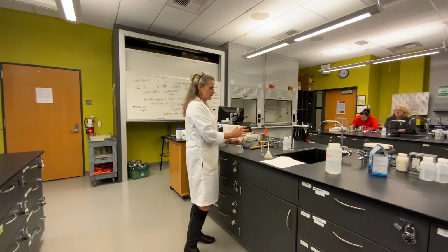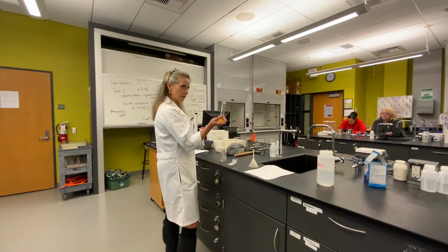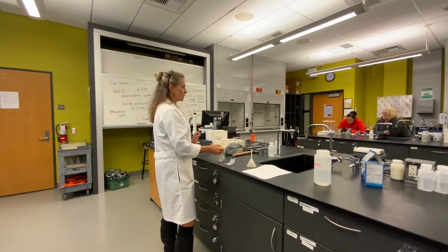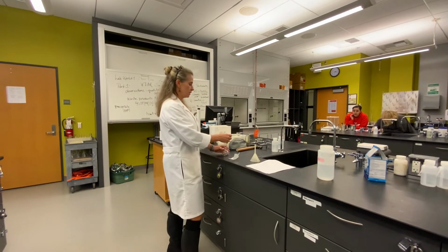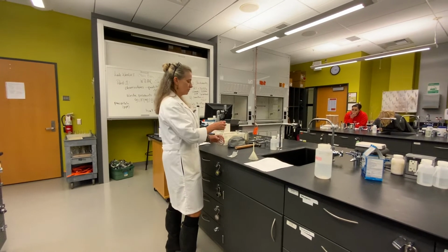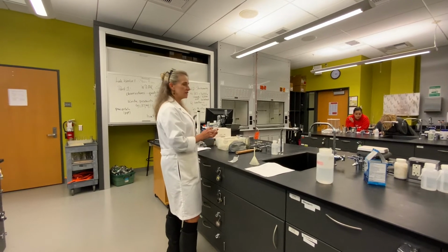So do the best you can to get all of that in there, all right? And then when you pour the 25 mils of hydrochloric in, it's going to go slow. So pour a little bit, swirl it, okay? Pour a little bit more, swirl it, and pour a little bit more, swirl it, all right? So now you've got this reaction, and you're going to see the carbon dioxide.